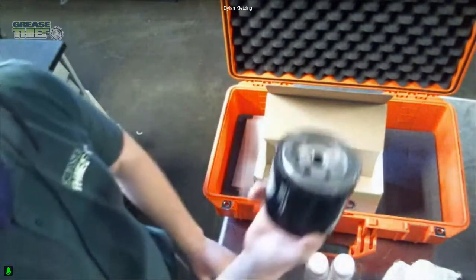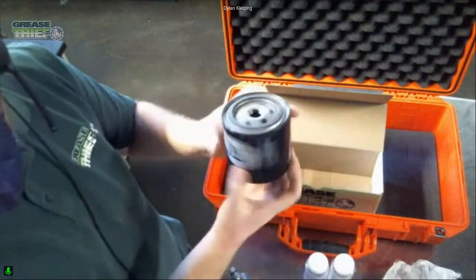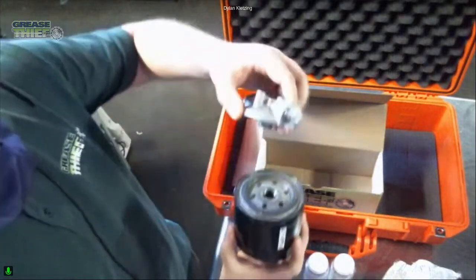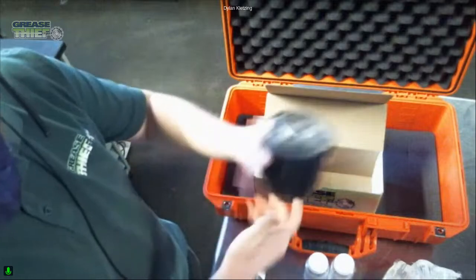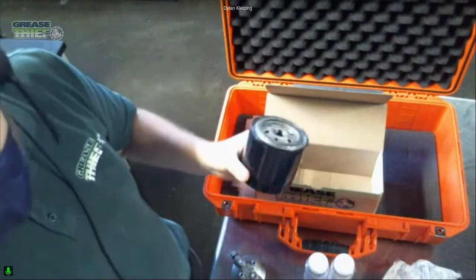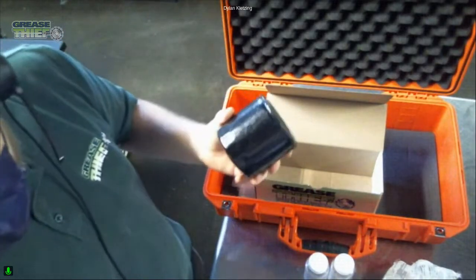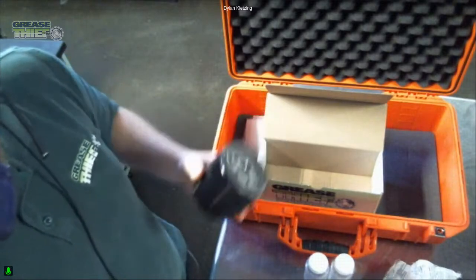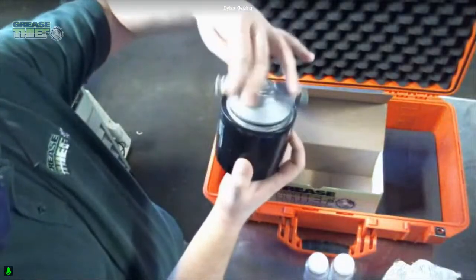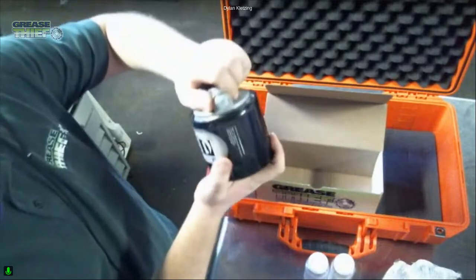Ordinarily, this filter would be taken off of a hydraulic system or a vehicle or anything. Rather than just throwing it in a box or a bag and shipping it, where it's going to tilt and oil's going to come out and ruin the analysis because the oil is no longer in there, we can screw this cap on, and it'll seal, it'll mate to the seal on the filter.